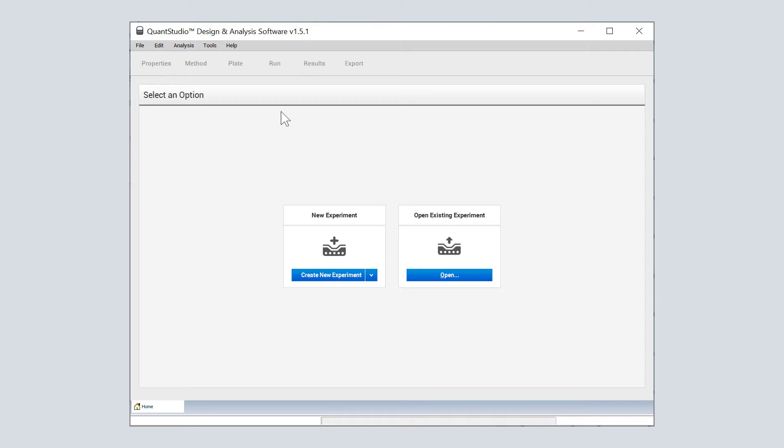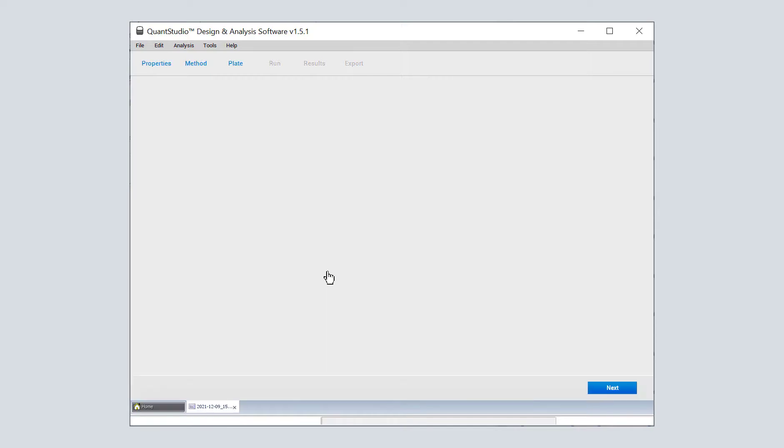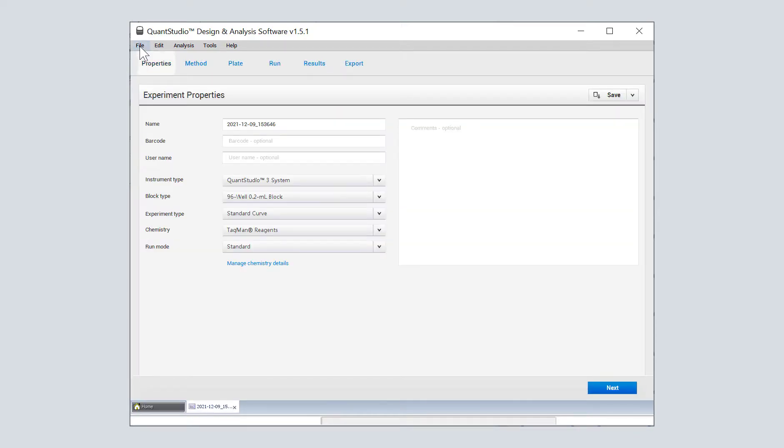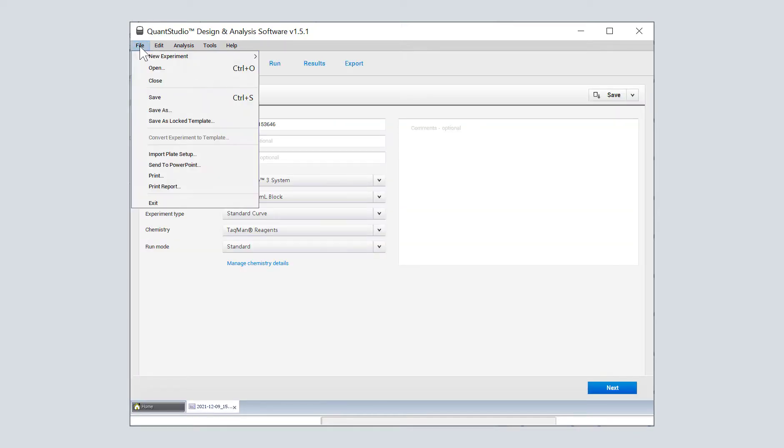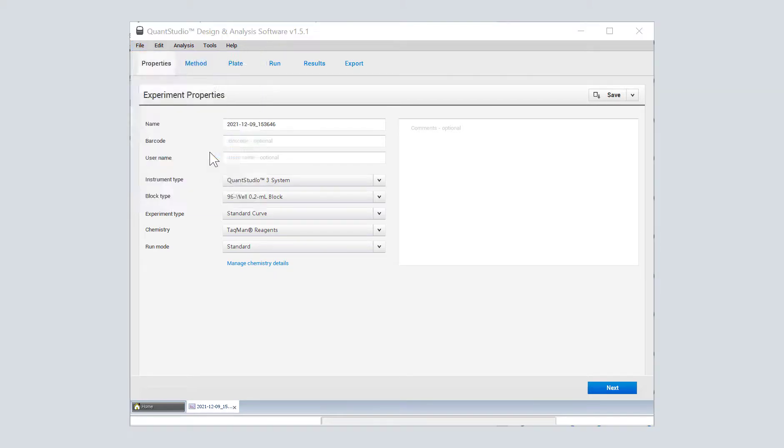Now we've switched over to the QuantStudio Design and Analysis software, and we're going to set up our new experiment. In our new experiment, we want to import the samples that we just set up. So we go to File, Import Plate Setup.